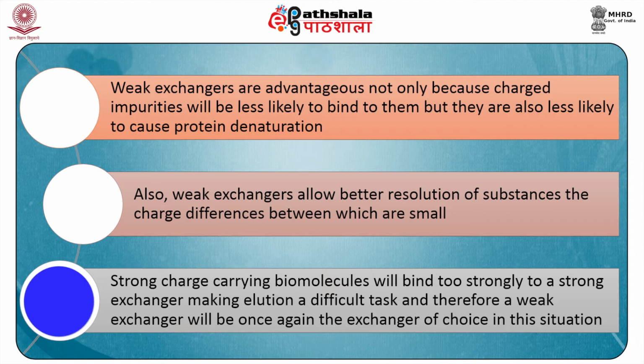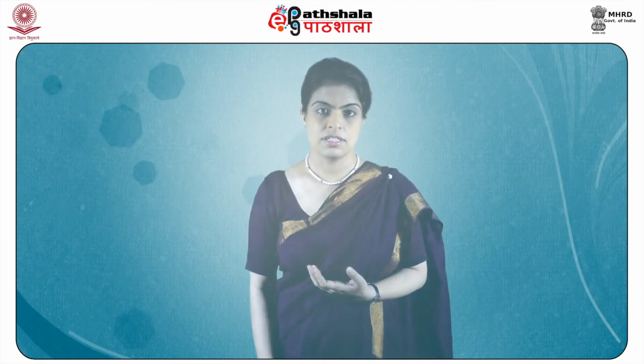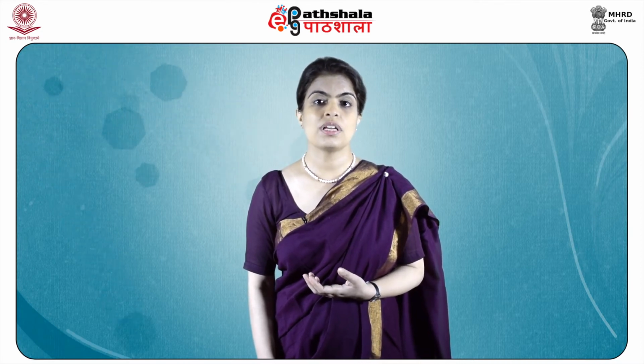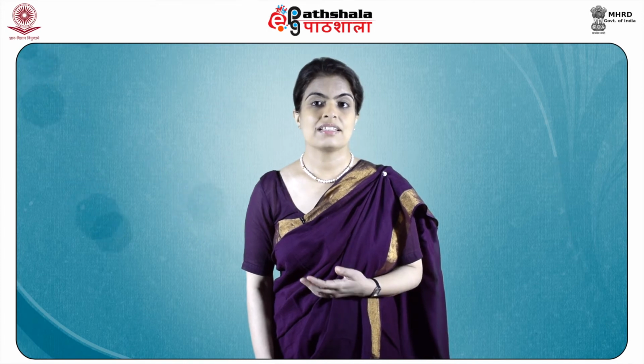Strong charge carrying biomolecules will bind too strongly to a strong exchanger, making elution a difficult task, and therefore a weak exchanger will be once again the exchanger of choice in this situation. Thus, a weak exchanger is more advantageous than a strong exchanger. Strong ion exchangers are needed when working with macromolecules that are unstable at low ionic strength.